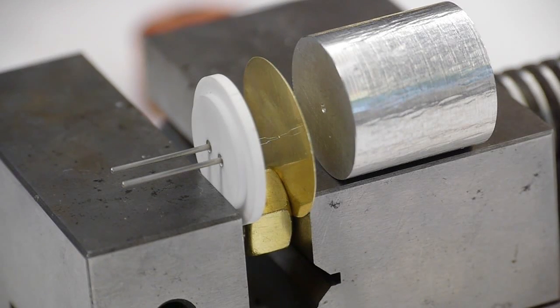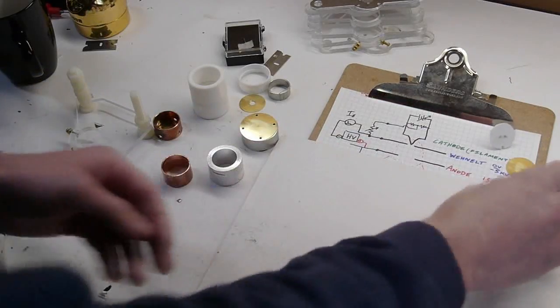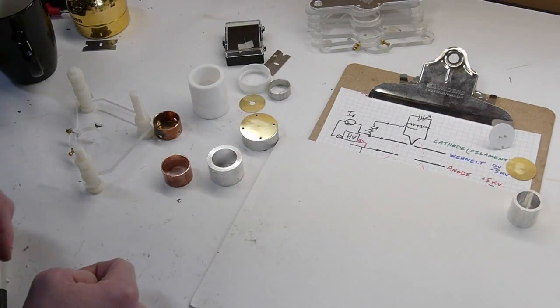We'll talk about that, and then there's a fair bit of space between the Wenelt and the anode. So I'll put these out and talk about what kind of voltages are on these.